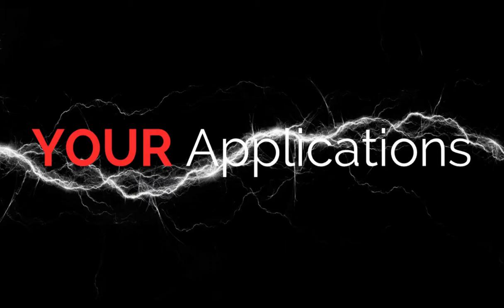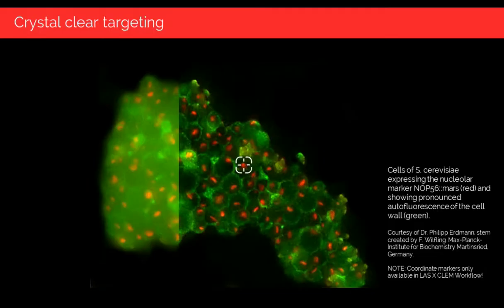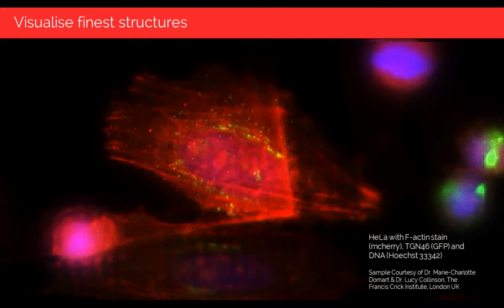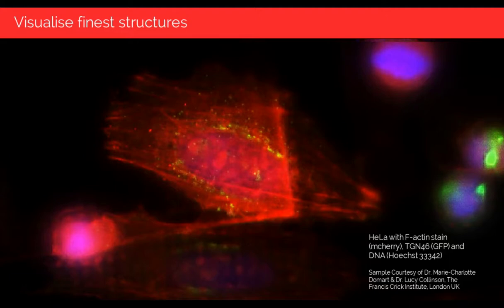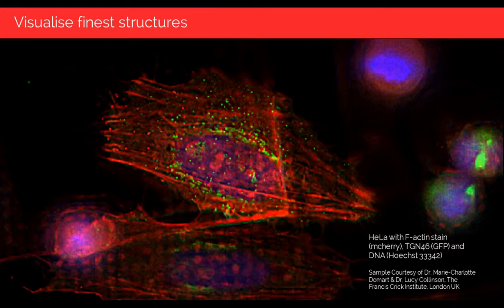Coming back to the Thunder technology — here is the yeast example again, where the nucleoli are now much easier to identify because the haze is removed. Another example shows HeLa cells kindly provided by Lucy Collinson's lab, with fibrous actin labeled in red, the trans-Golgi network in the background in yellowish color, and nuclei in blue. The Thunder results are clearly visible: the actin fibers appear sharply and the trans-Golgi network is nicely discriminated from the background.